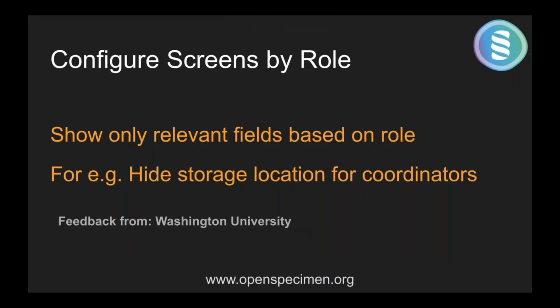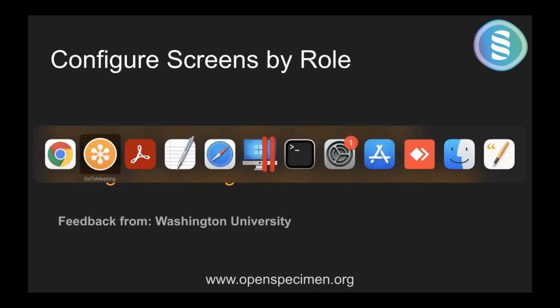And you also see, related to this, that you don't want to show things like, say, storage container to the coordinators, because they are not going to place the specimens in a freezer, right?